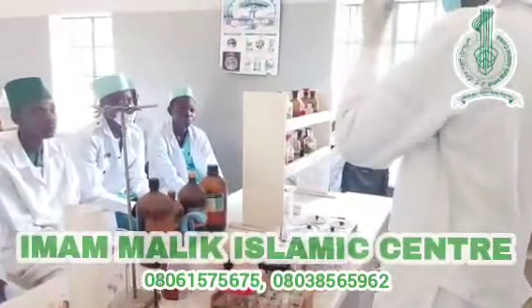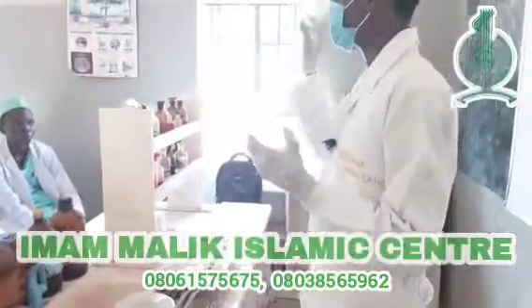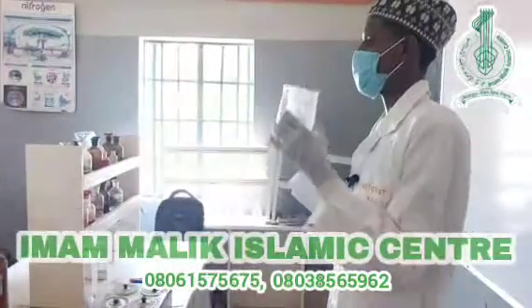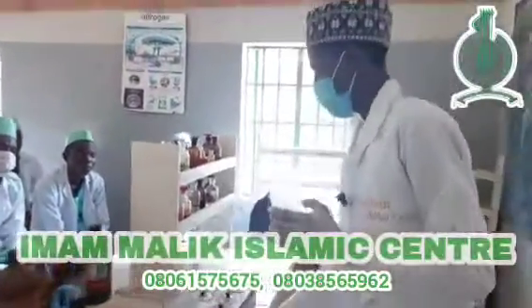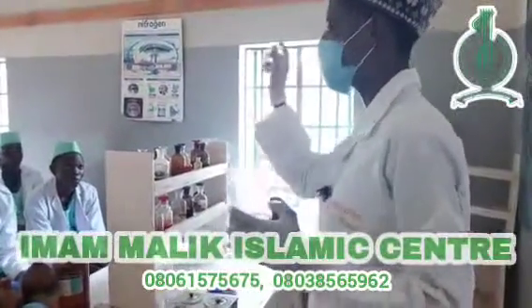We have different sizes of beakers. This is graduated 250 mils or cm cube. This is graduated 500 mils or cm cube. You see, it's just the capacity, the volume that differs. We have different sizes. This is 75. We have 100. We have 50. We have 20.